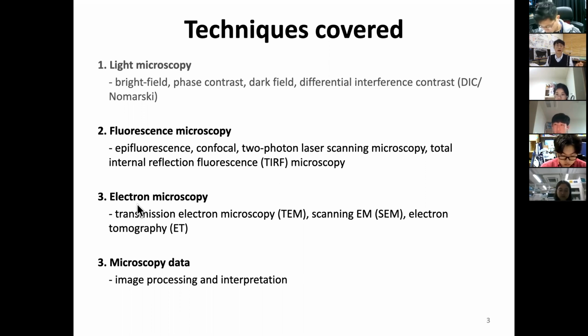And the second part is electron microscopy. There, you guys heard we have many expensive microscopic facilities in our school, and we have a central research facility which has millions, tens of millions of dollars of this expensive equipment. It would be great if you know how they work and what you can expect if you have a sample. All right, so we will discuss TEM and SEM in this class, and later, how to process images and how to interpret them.